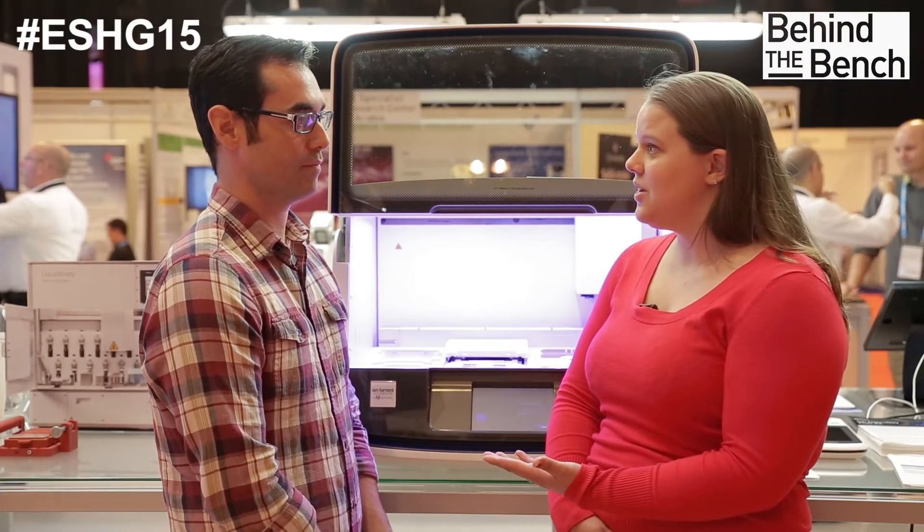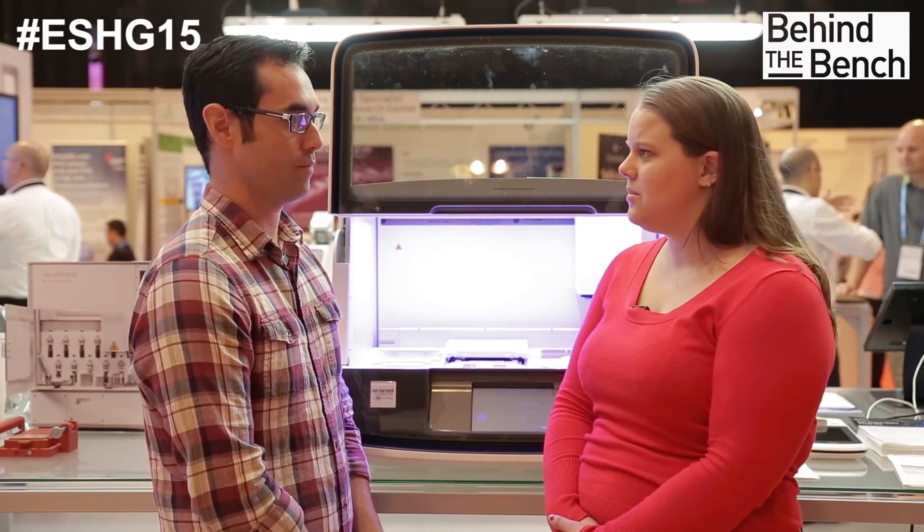So I know you have a poster here at ESHG. Can you tell me a little bit about your poster? Sure. I go over the ease of the workflow — we have 10 nanogram input, one or two pool designs, super simple to use, better data quality. We've also innovated to add pre-plated barcodes, so you don't even have to worry about pipetting barcodes into your plates anymore. They come in color-coded plate sets. You simply add your DNA and press go.